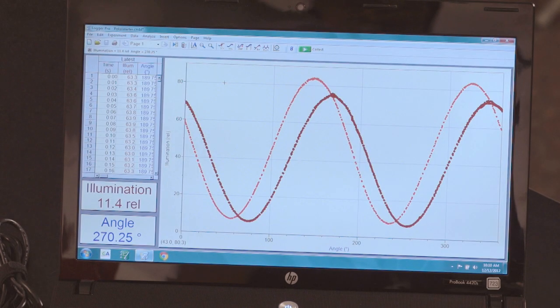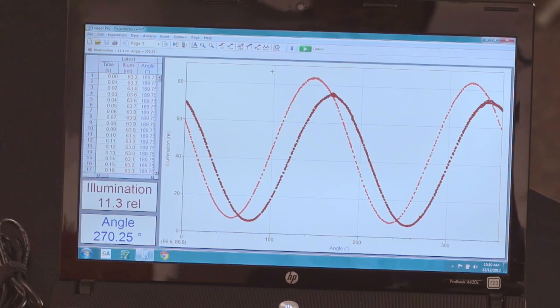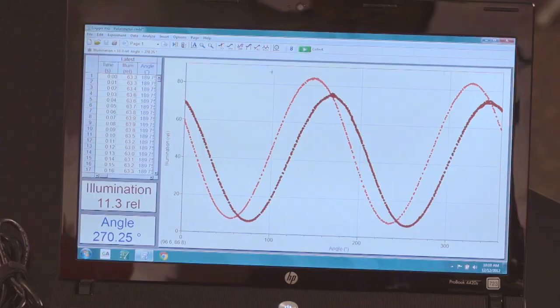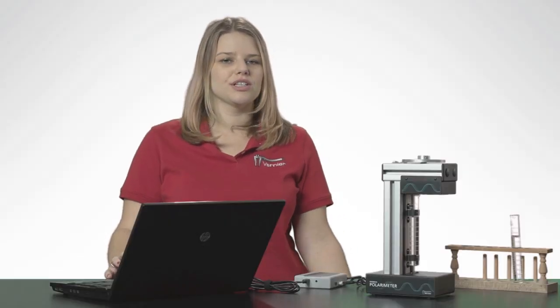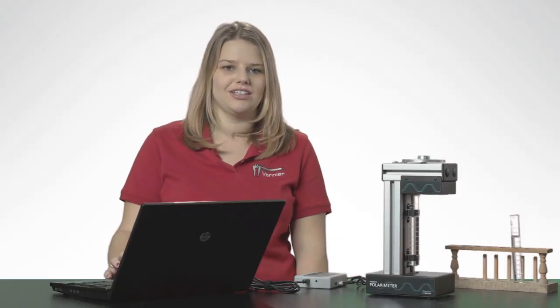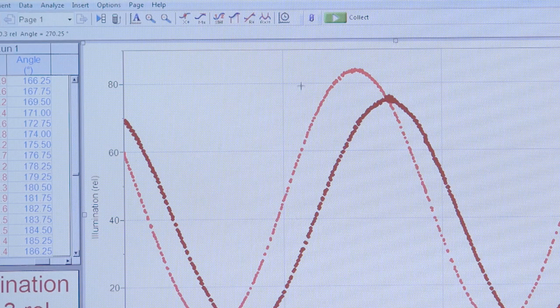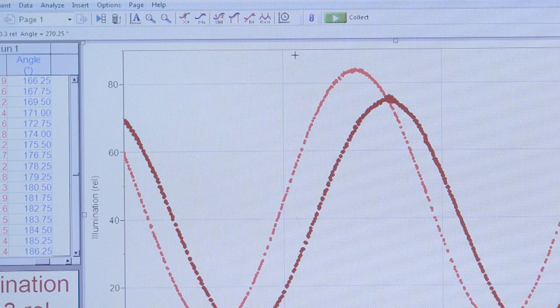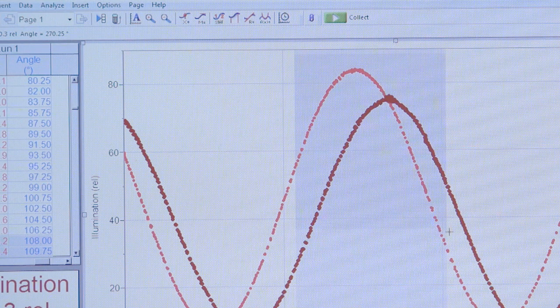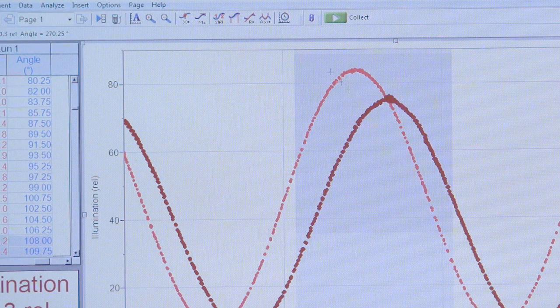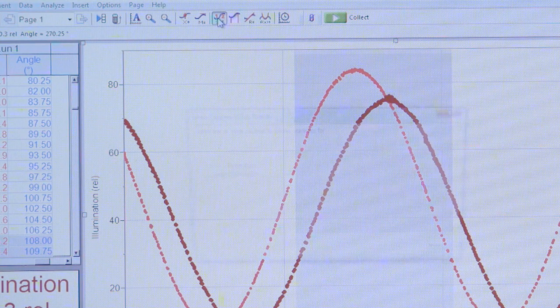This data can be analyzed quantitatively several different ways in Logger Pro. The quickest and simplest way to quantitatively analyze these results is to use the statistics feature. To do that, I select the first peak after angle zero and tap on the statistics button.